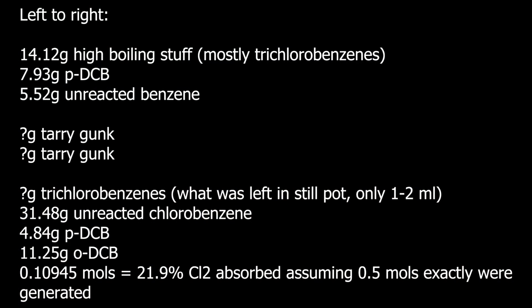From this, you can probably see that the first runs with iron sulfur and TCCA sulfuric acid, the para to ortho ratio is significantly higher than that for the aluminum chloride nitromethane run. This checks out based on the data reported in both the papers I pulled the procedures from. So I could have made or bought some anhydrous ferric chloride to use as a catalyst, but there are already videos out there that show it used in chlorinating benzene, so I thought I would try something different.